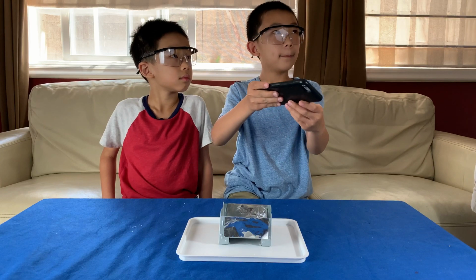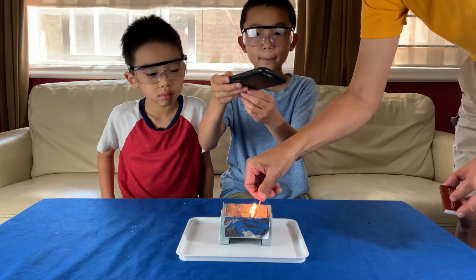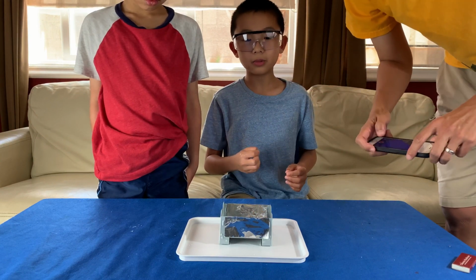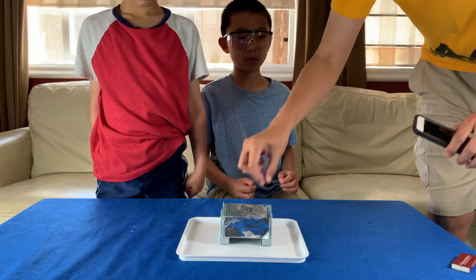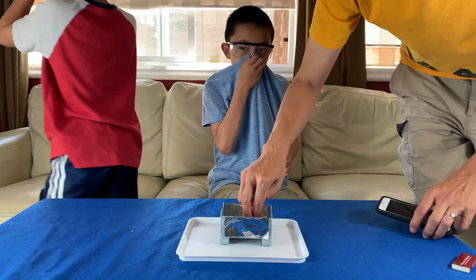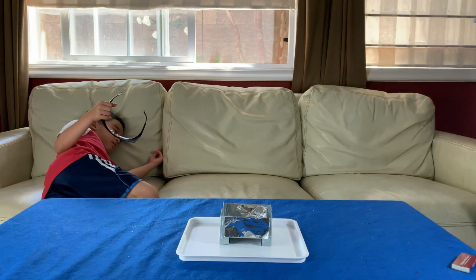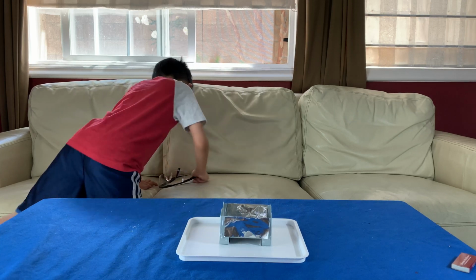Okay. Shoot. What happened? I just tossed it in. Well, why would you do that? No, I thought maybe it'll catch on fire. All right, I think I need a long stick. You're wasting too many matches. I know. No, you're not supposed to toss it in, because you're not supposed to let the whole stick burn. Okay. All right. You have to follow the directions. All right, this time it should work. That's what science is all about. Experiment. Yeah, but you have to follow the directions. I know.